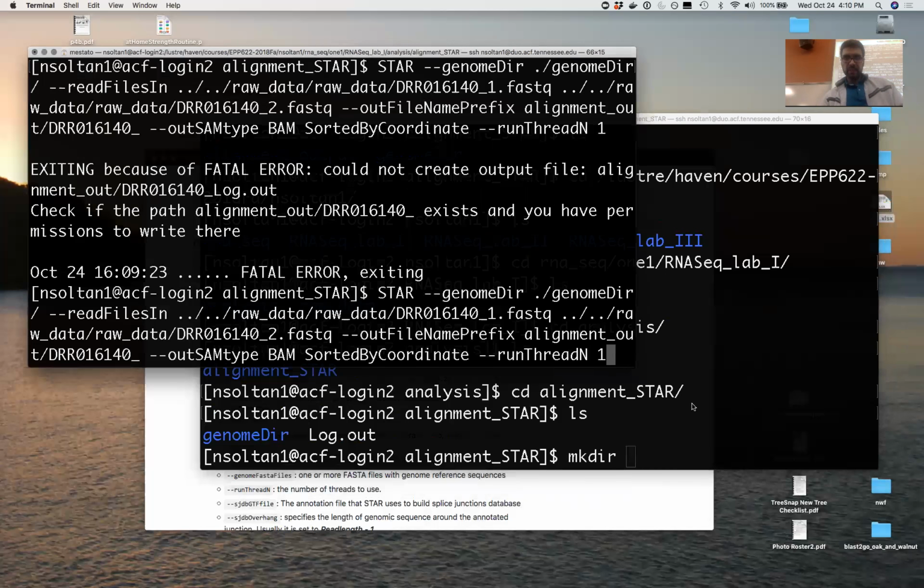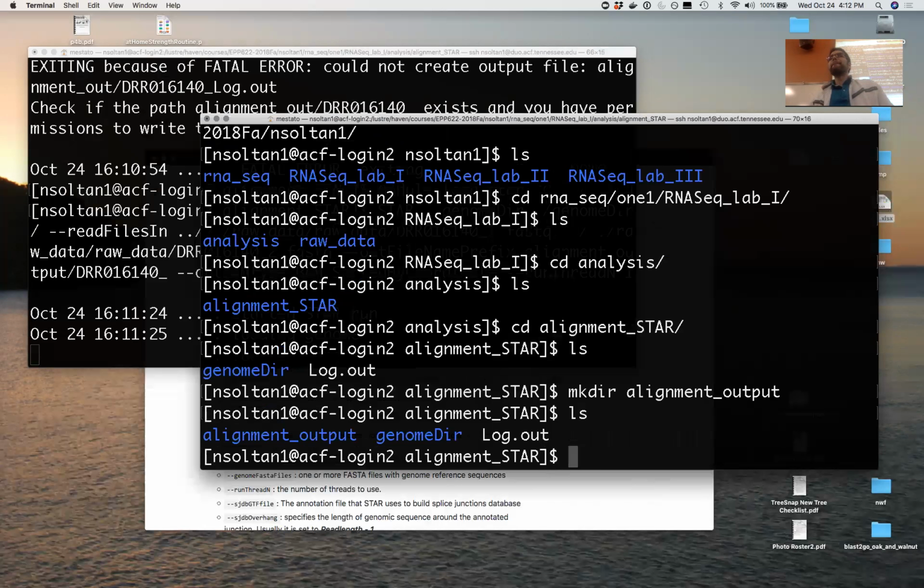So I will post something like, here is the kernel of the qsub command, a shell script, paste in the commands to run the genome generation. I'll figure out some way to show that. I'll try to have that posted tonight. I'll put it in my class.